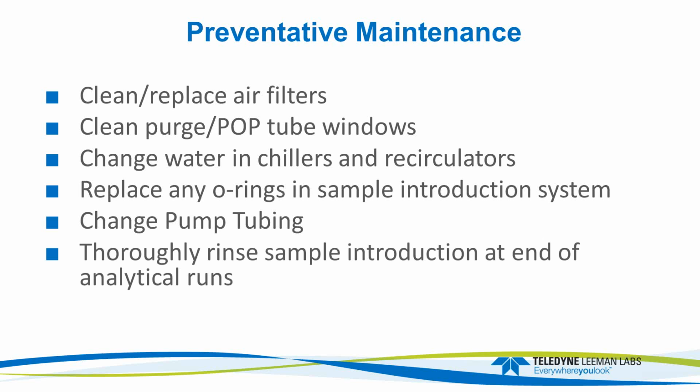Okay. And if you don't do any of the other stuff, this is the one thing that I always do when I run my instrument. At the end of the day, I let that thing rinse on deionized water for 20 minutes to half an hour, all the time. If I'm not here, I just let it extinguish after running the samples and put a 30-minute rinse on it, right? That way I don't run into problems where my spray chamber has got crystals in it because it's dried out over the weekend or whatever.